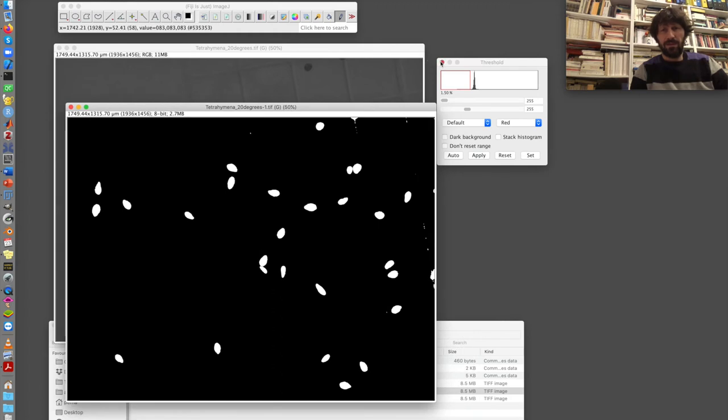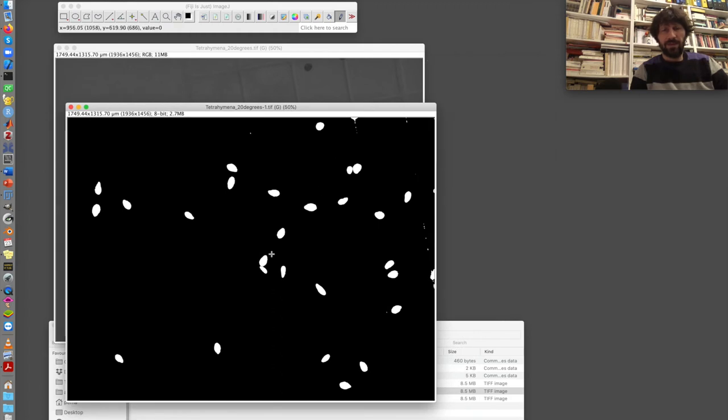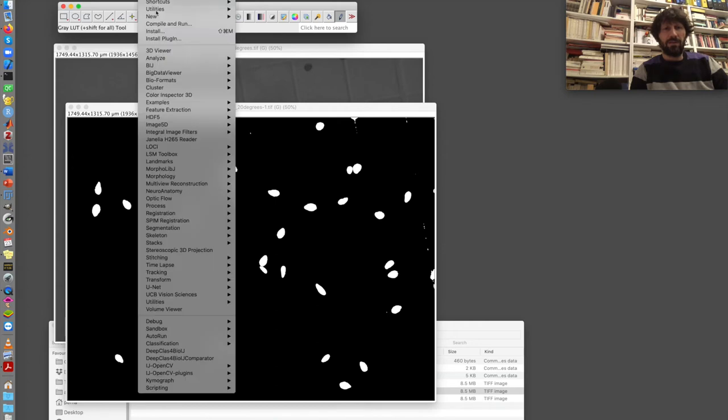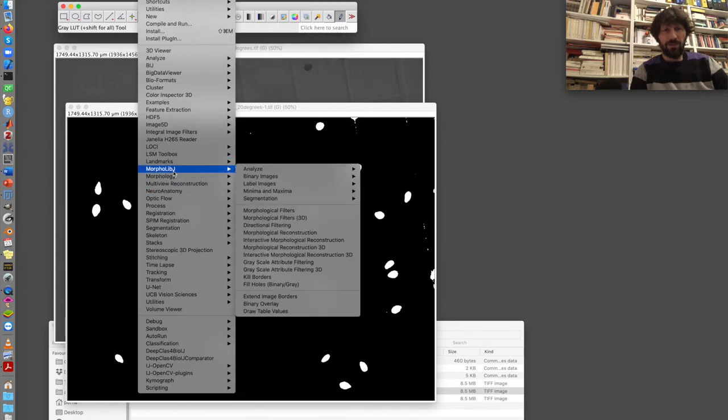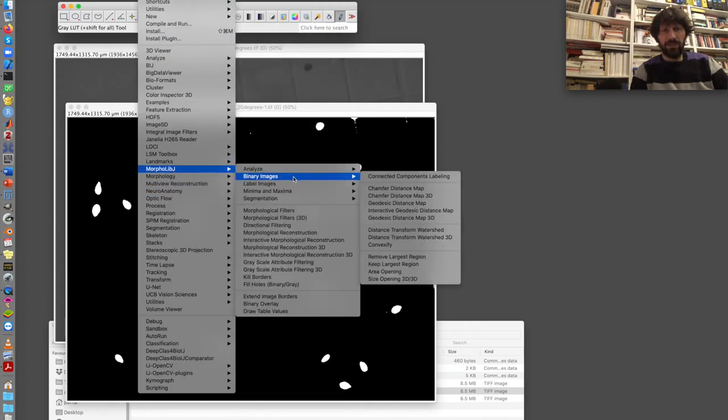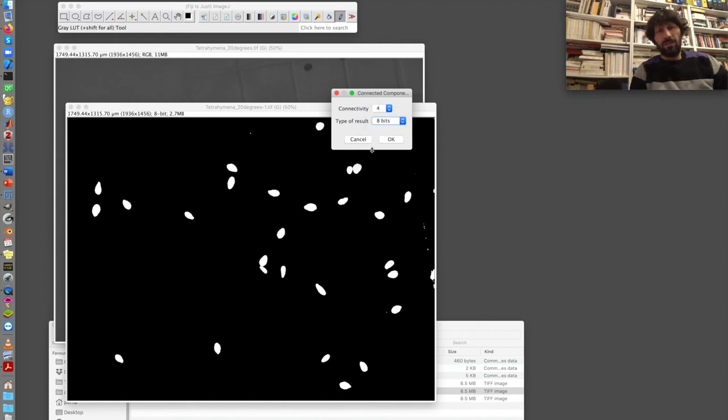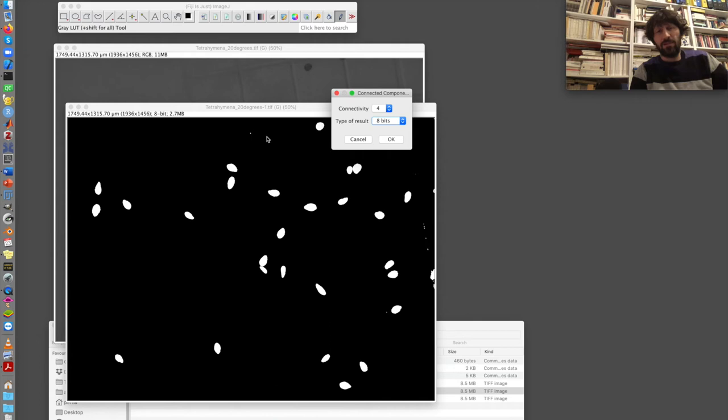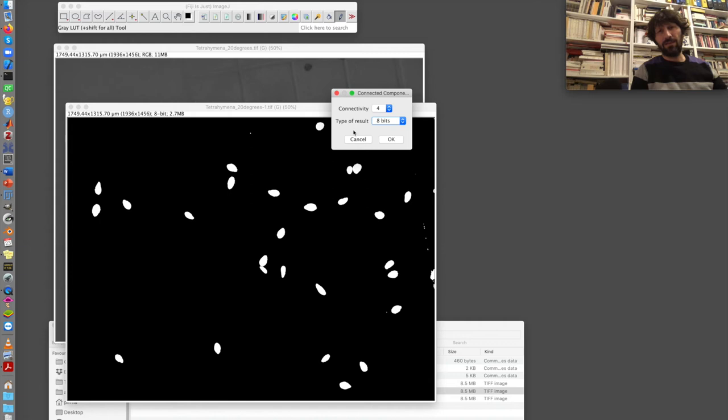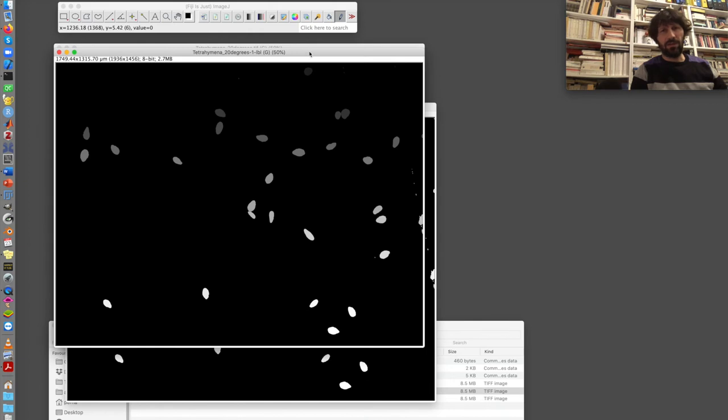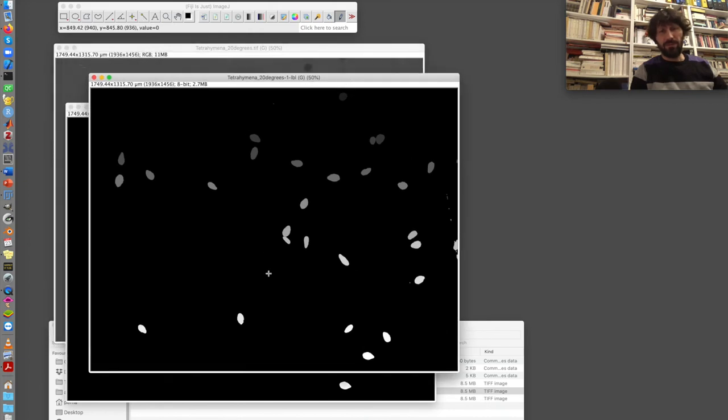Now, this time I run the analysis using the plugin, MorpholibJ. So plugin, MorpholibJ. This is a binary image, and I want to do connected component labeling. I use a connectivity of 4, and I take the result of 8 bits. In this case, 8 bits is sufficient because I have a few cells and a few pixels of noise. As long as the number of components is lower than 255, then it's okay to have 8 bits. And in this case, I think this is what I need. So I have these labels done.